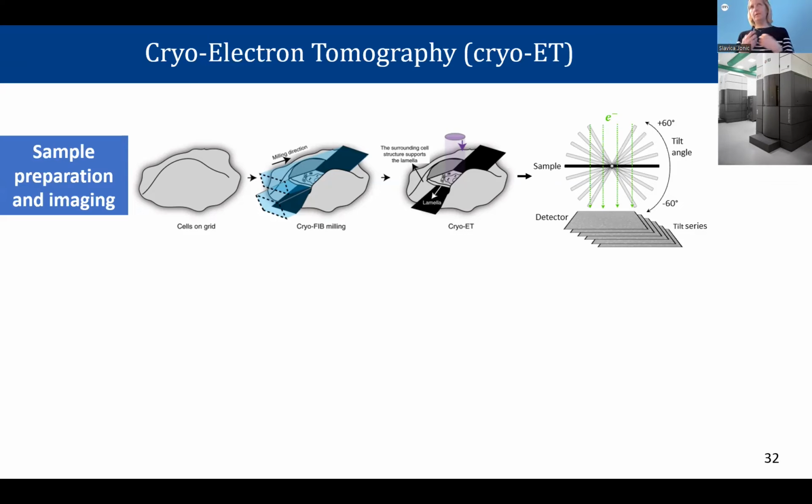Unfortunately, we did not personally compare this with CryoDRGN, but we will. I will have a master student, so I'm very eager to see how this compares with CryoDRGN. But as I said in the beginning, the main difference is that CryoDRGN will always give you density maps. It will not give you atomic models. But yeah, we did not compare it with the same data.